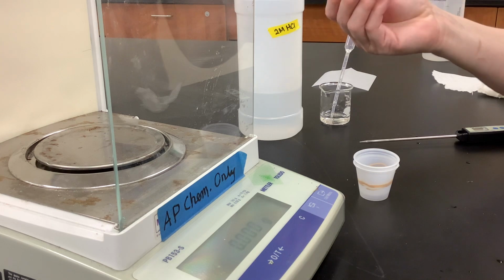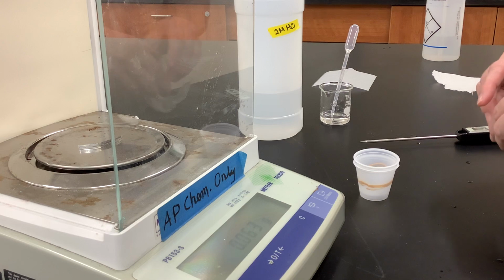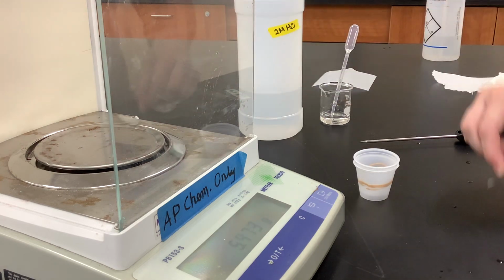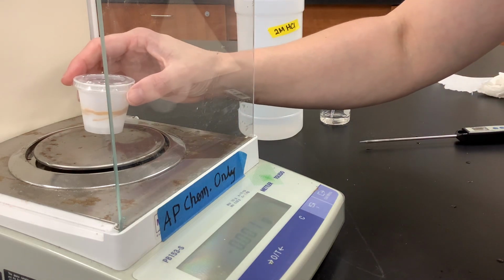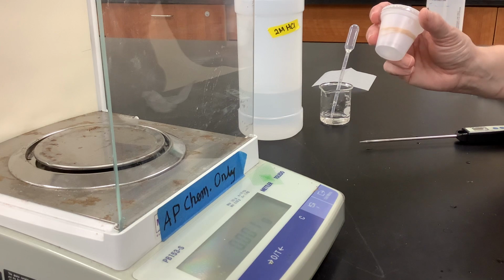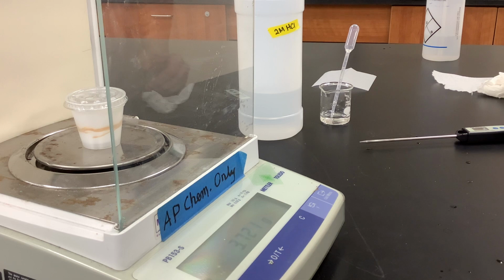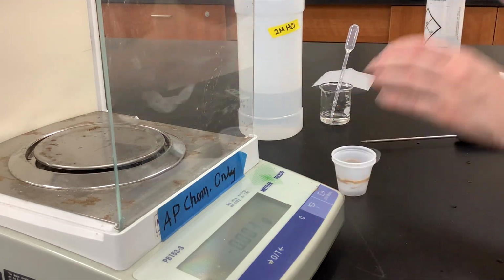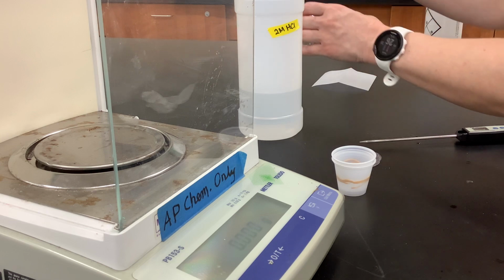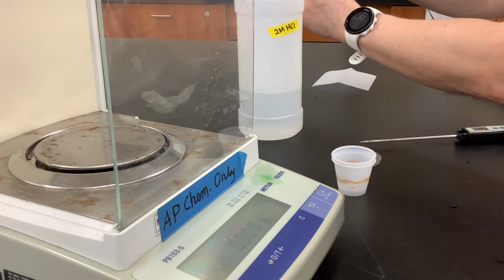Okay, we take our third piece of magnesium, place it on the scale. Let's see, 0.063. Okay, is what we got our mass to be. Take the mass of our calorimeter and lid without anything in it. Okay, let's make sure everything's zeroed. Boom. Okay, so 3.722 is what it looks like. 3.722. Okay, we're going to measure out our approximately 10 milliliters of our hydrochloric acid.